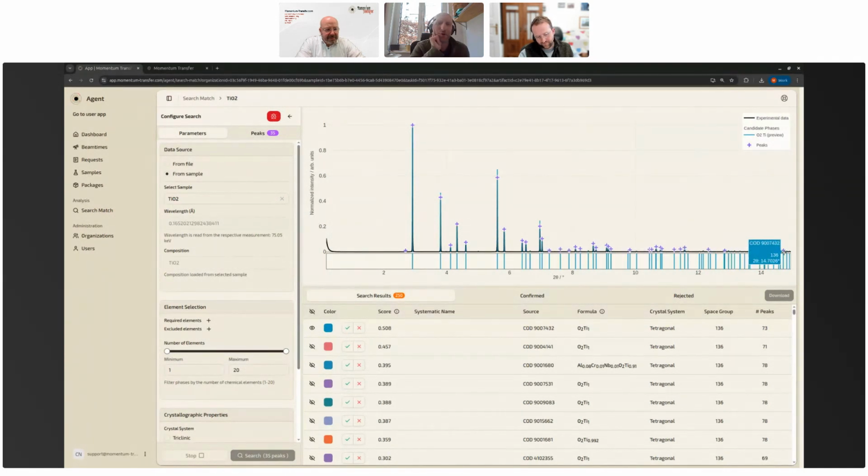And they say, well, the material that I'm working with has interesting diffraction peaks around 30 to 50 degrees. Yeah, but that's on a copper source. When you use really high energies, it's contracting your reciprocal space down into smaller angles. So that's why we get a large Q range, which is directly related to the size of reciprocal space that you're probing in a smaller angular range.